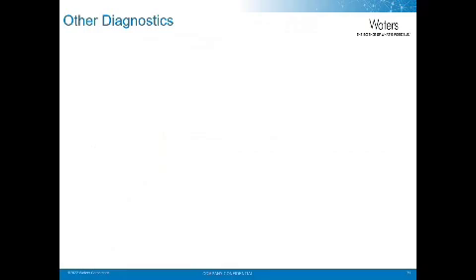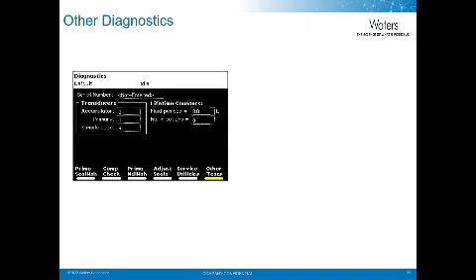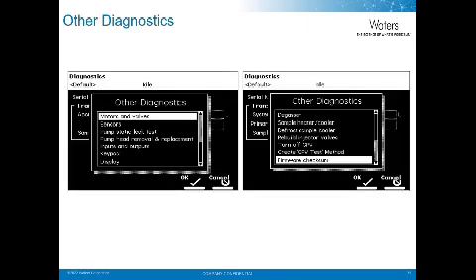The other diagnostic screen is used to test or check the system's functional status and would be located here. Pump head removal and replacement is used when you PM the primary and accumulator pumps. Make sure you follow the instructions on the screen very carefully when you do so. You will need to use a pin plug. Make sure it is in good condition when you perform this test.